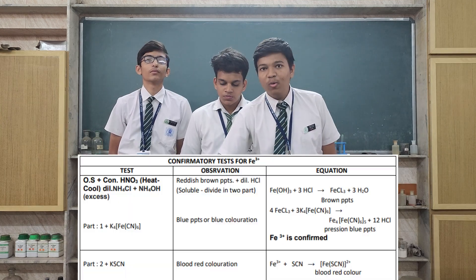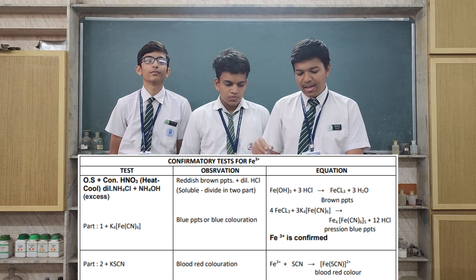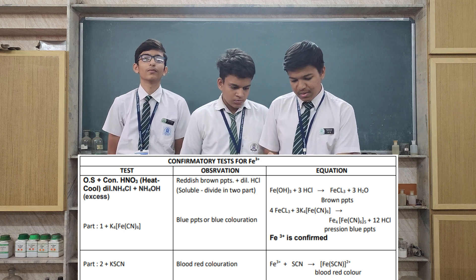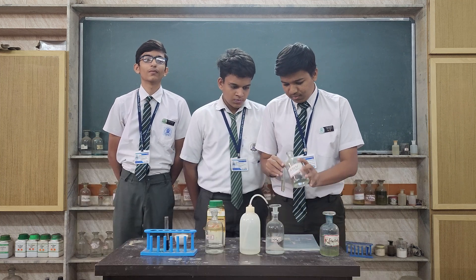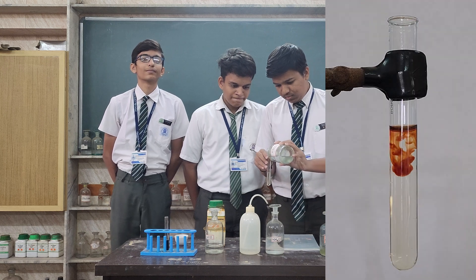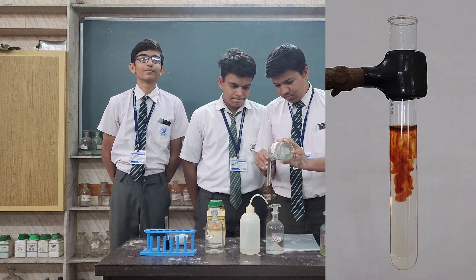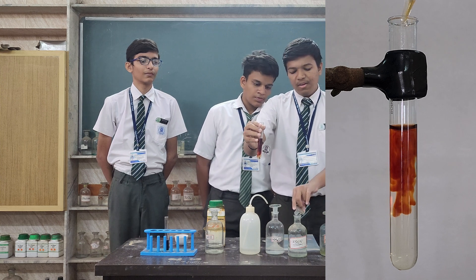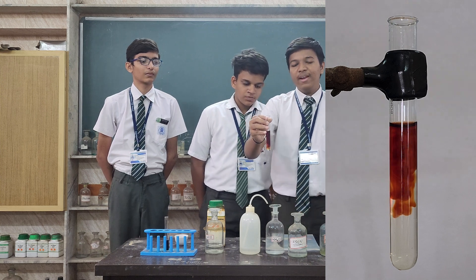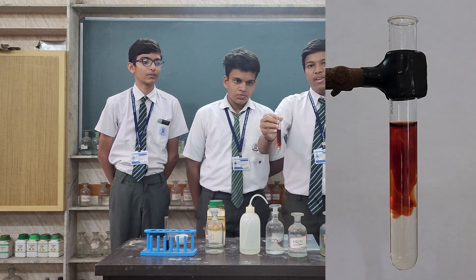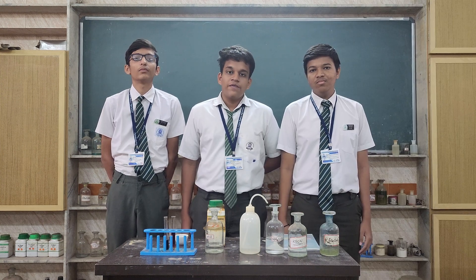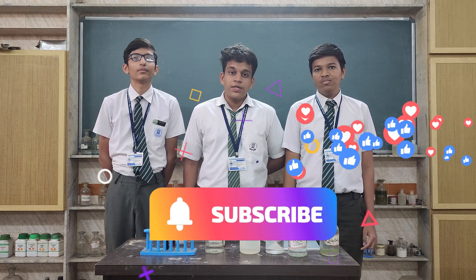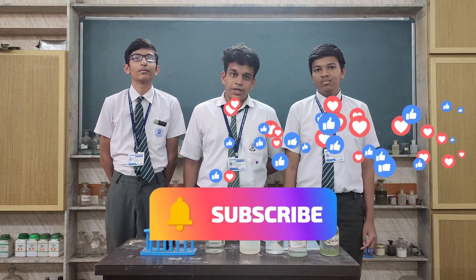Now Part 2 — add some KSCN. The red color confirms that Fe³⁺ ion is present, and this way we can detect the Group 3 cations and confirm it as Fe³⁺.